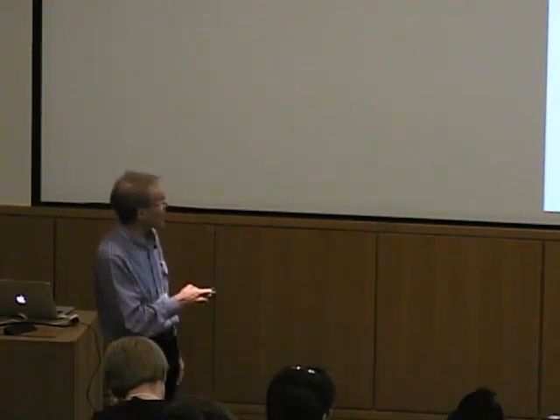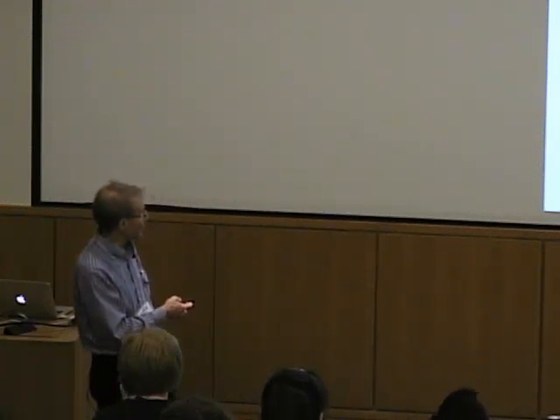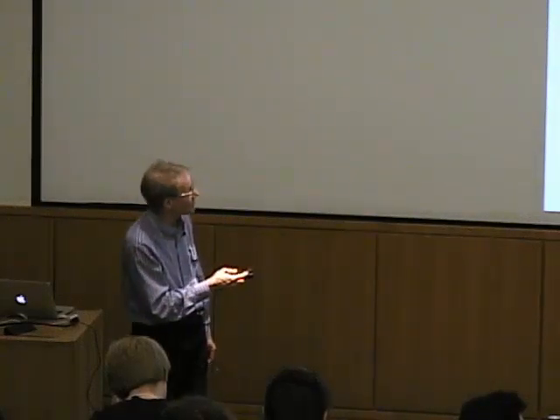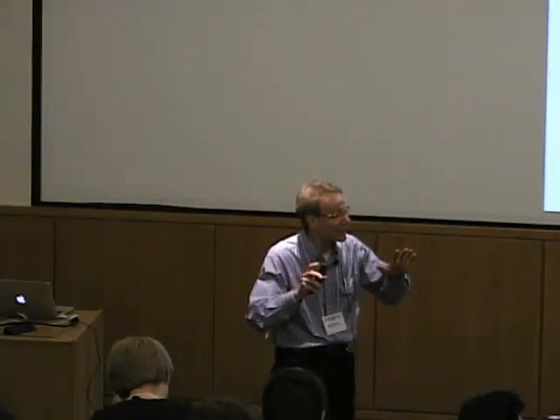Okay, so we can say the site is in fact enthalpically more favorable for copper 1. Copper 1 entropically, there's desolvation, but maybe less than there was with copper 2. Still have displaced protons, but remember these two histidines, they're being protonated from the buffer. So that's an entropic penalty. So all this comes into this. So basically what we found is that copper 2 and copper 1 have very different binding thermodynamics when they bind to this very same site.